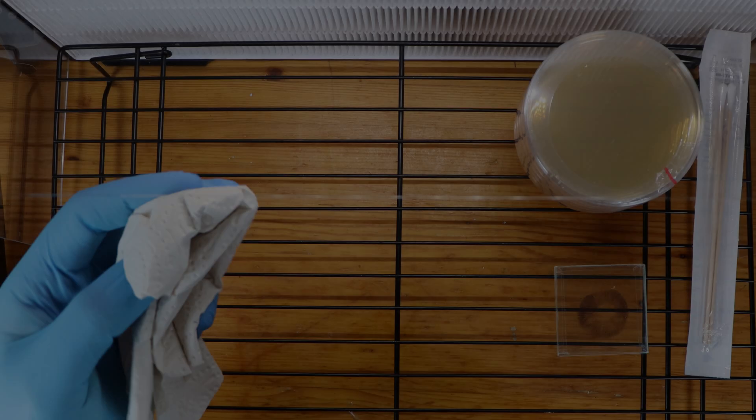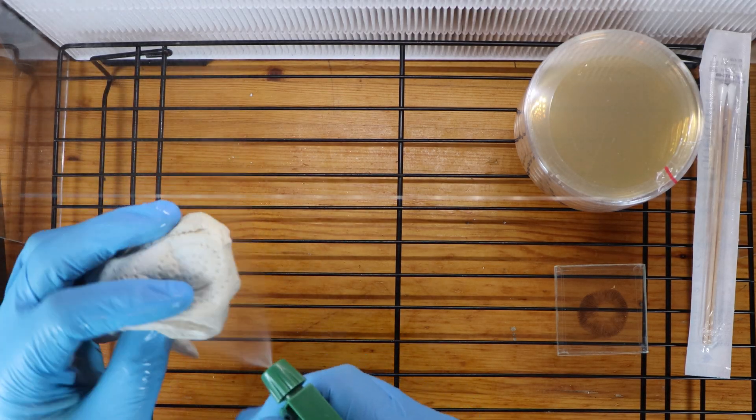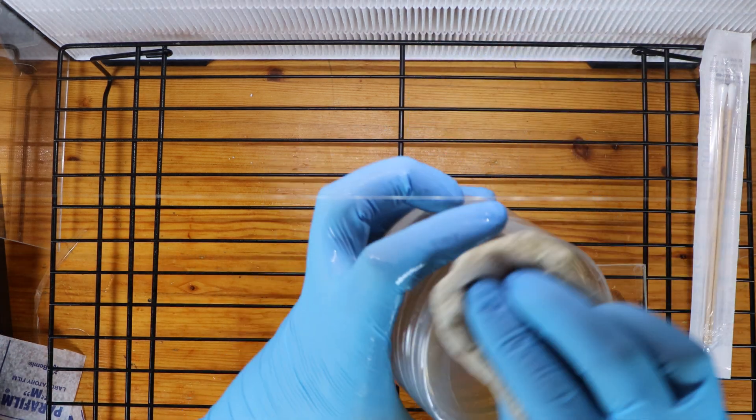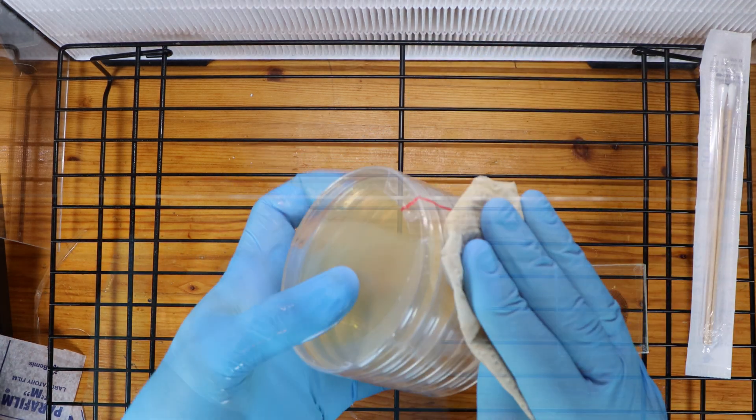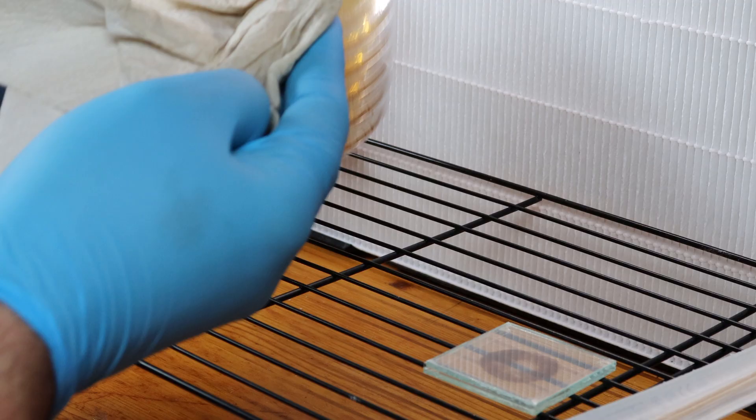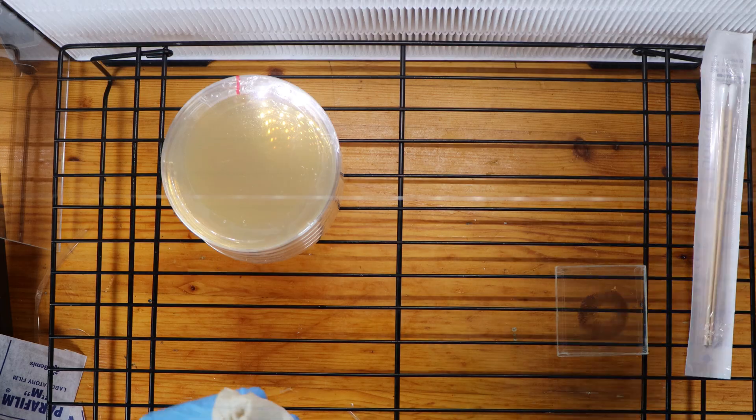Okay, first we want to sterilize all surfaces we'll be in contact with. This includes gloves, the petri dishes, the spores, the work surface as well. We're wiping them down with a 70% isopropyl alcohol solution. And this sterilizes things quite nicely.